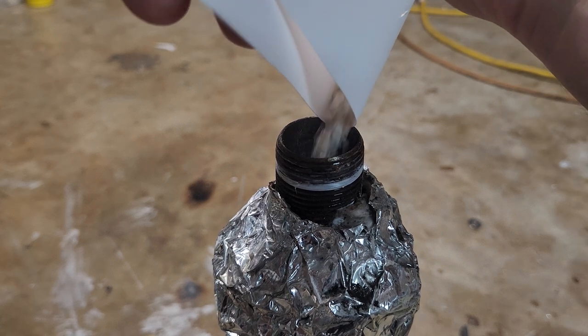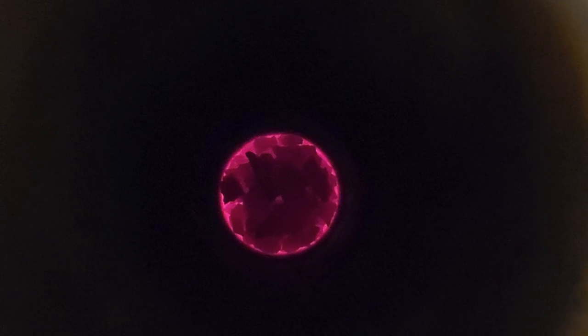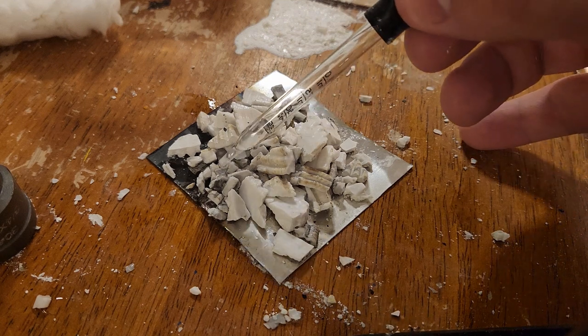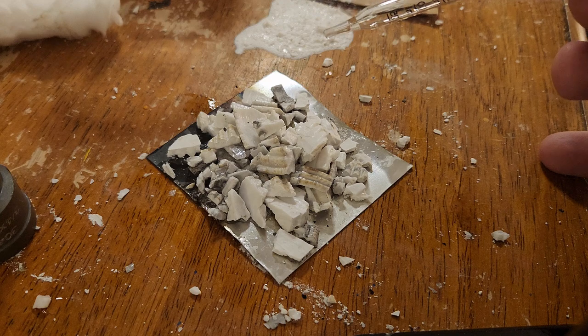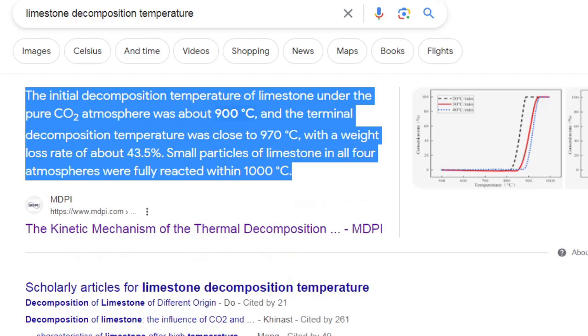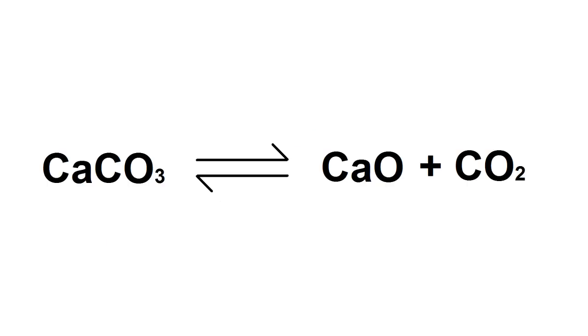I initially did this with the pipe cap connected directly to my gas collection ball, but found that I wasn't collecting anything. To confirm this wasn't just from leaks, I pulled out the crushed shells and found they weren't reacting with water, meaning the furnace wasn't getting hot enough. After doing more research I found a graph of reaction temperature versus pressure — at one atmosphere it's 900°C, but that doesn't mean CO2 suddenly comes rushing out. The CO2 just sits inside the pipe in chemical equilibrium with the limestone, separating and recombining back and forth.